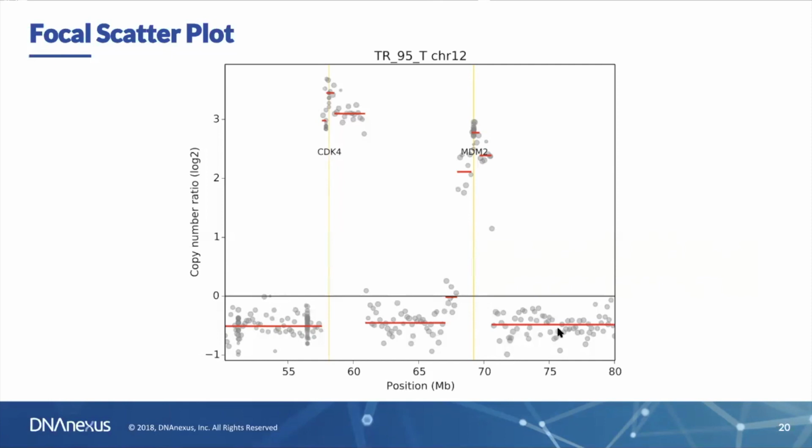The baseline looks like a copy number loss. It's below 0, but not a deep deletion. And then we see a lot of supporting data points and segmentation around these 2 genes, CDK4 and MDM2. For cancer samples in particular, for bulk tissue, solid tumor sequencing samples, this is what you're seeing here with 3 segments. This kind of pyramid shape is real. What happens is that a somewhat larger genomic region is gained earlier in the tumor's life cycle, basically.